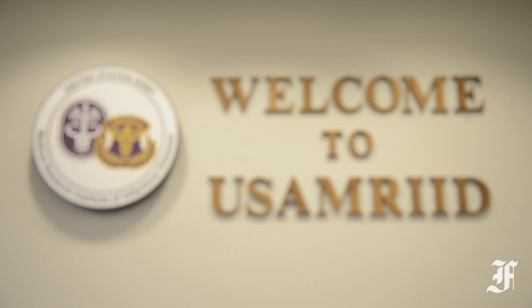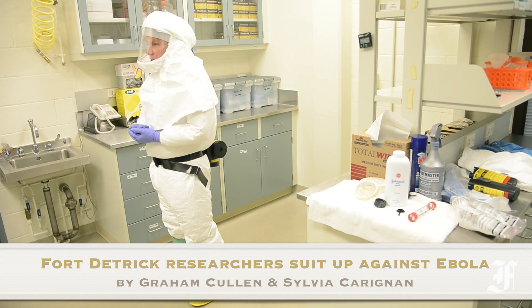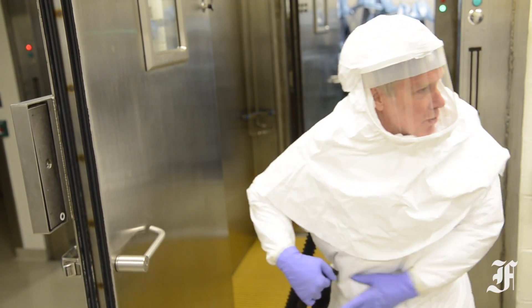For researchers studying Ebola at the U.S. Army Medical Research Institute of Infectious Diseases, the suits they wear, and just as important, the protocols they follow when taking them off, are a matter of life and death.